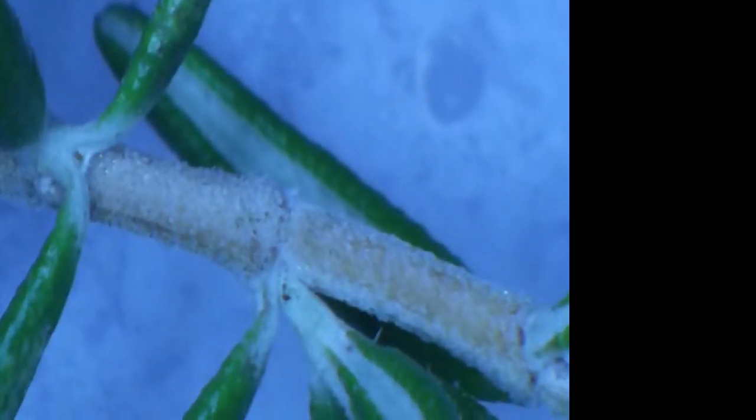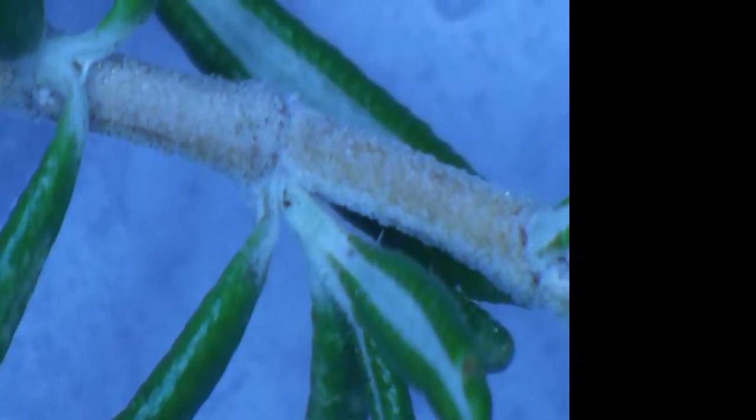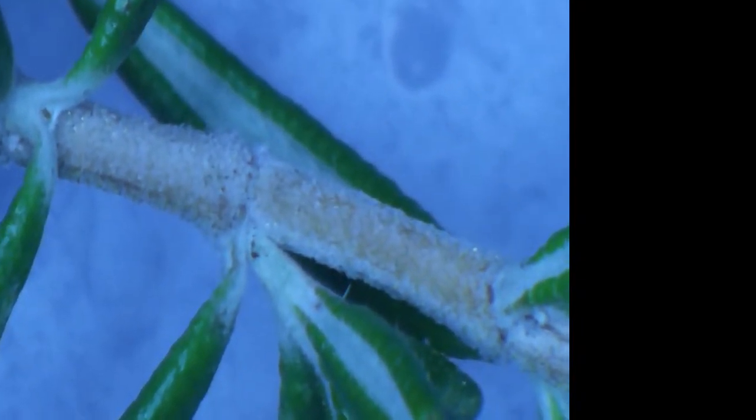Rosemary has these tiny little thick leaves, very shiny. And then when you go to the back side, they have that woolly look to them. The stalk is very woolly. All these aromatic plants have this kind of woolly structure to them.